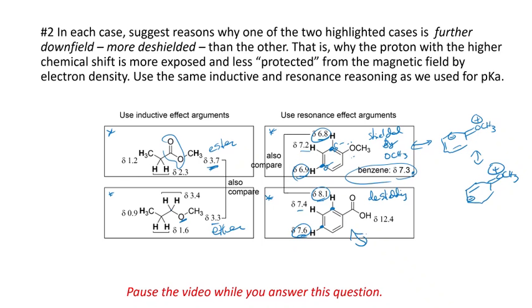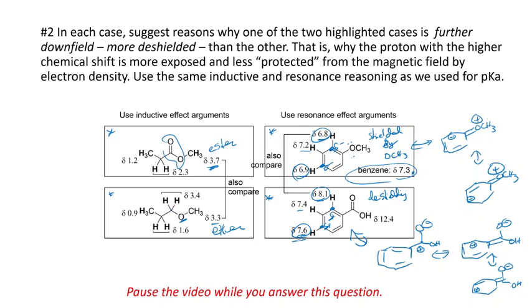Consider the resonance contributors. You see that? In both cases, our plus sign, now these are partially positive at these same 2 carbons. And that partial positive charge is really pushing these electrons down further on the NMR spectrum, de-shielding them all the way to 8.1 and 7.6.